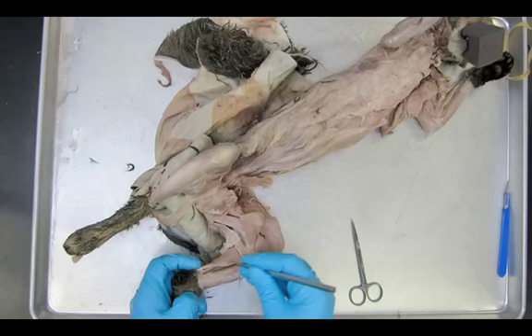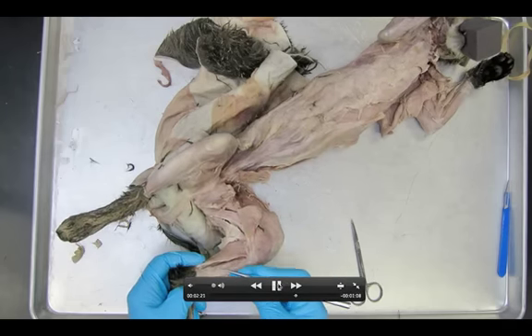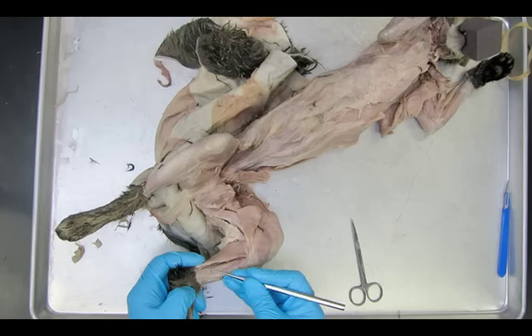One other thing we can see on this dissection — right by my left finger there — you can also see the Achilles tendon coming up here.